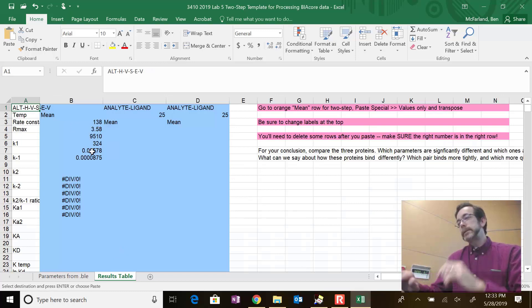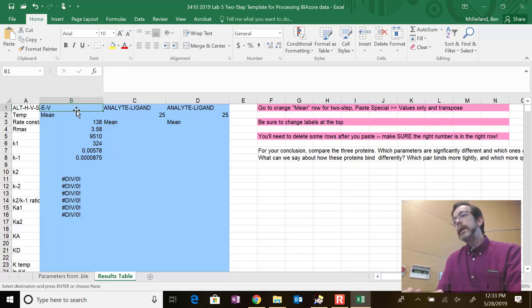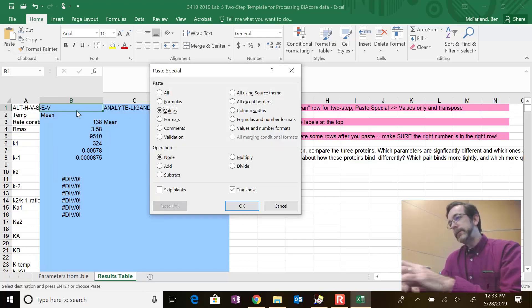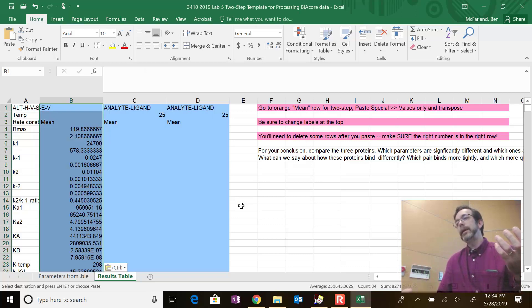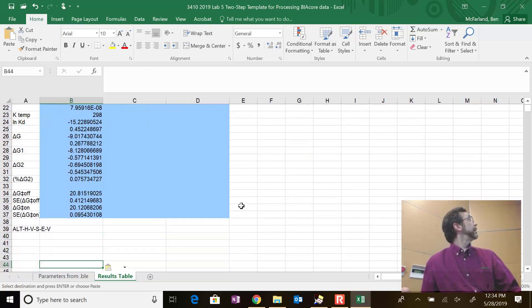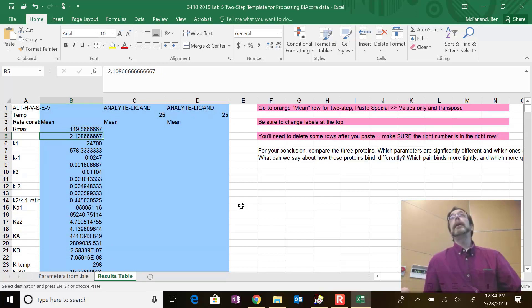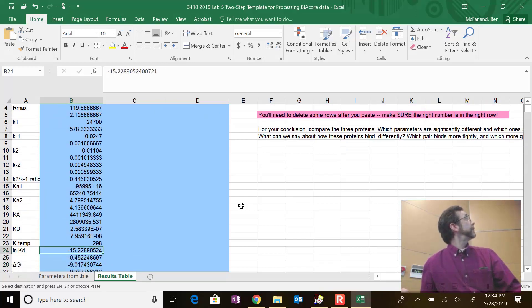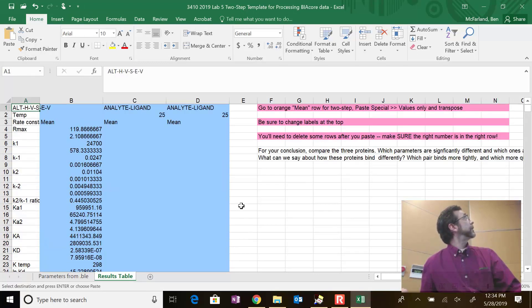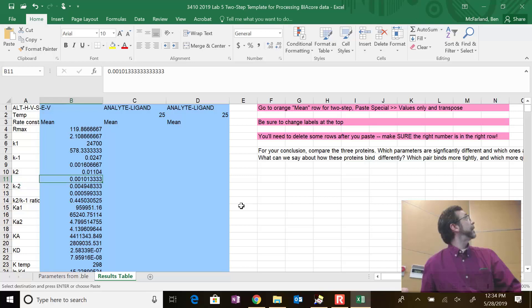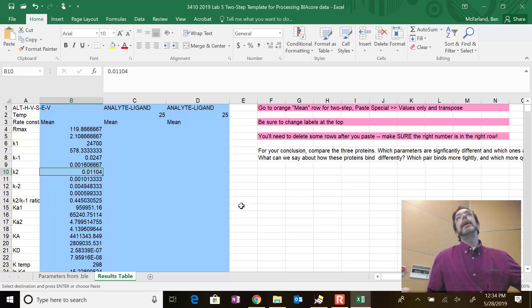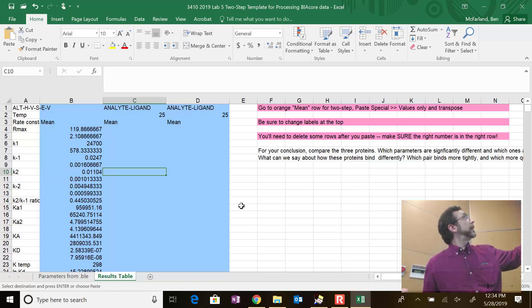I'll copy the orange row to show how it should actually be done. Alt-H, VS, E, V - and see it automatically selects those, then you say OK. It posts your data down. You just have to follow the steps: starting from the correct cell it will automatically paste your Rmax, K1, K-minus-1, and their errors below. This allows me to take your data and work with it later. Don't forget to fill in a title for each dataset so I can reconstruct what's going on.